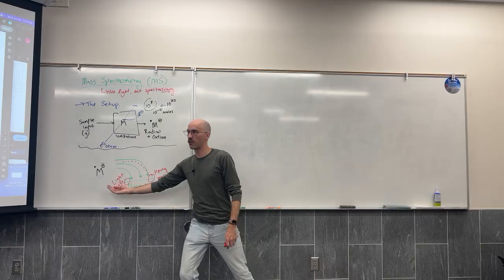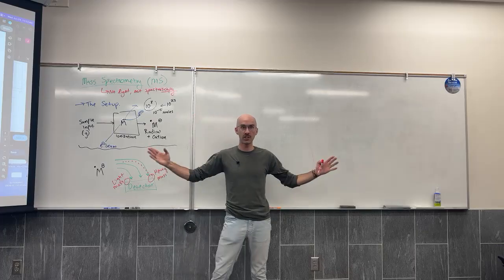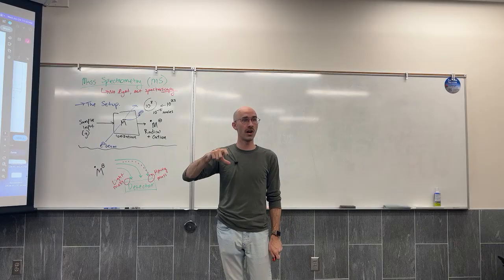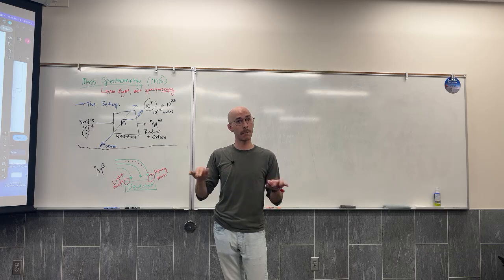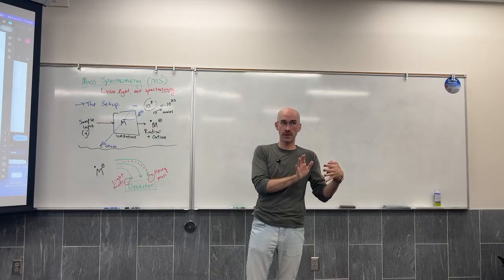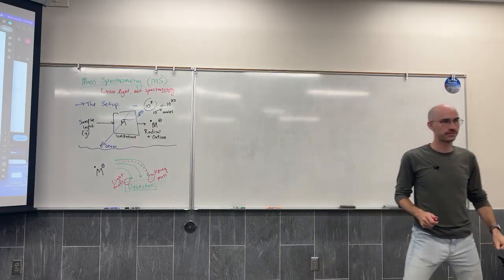But I like to think of what it would look like if all of them could be pulled towards the detector at the same time. The instrument knows when it's being hit by something heavy, when it's being hit by something light. In fact, it knows exactly the atomic mass. It's not a balance, it's not a scale, but it knows the atomic mass because of the force of the magnetic field and when that fragment hits the detector.